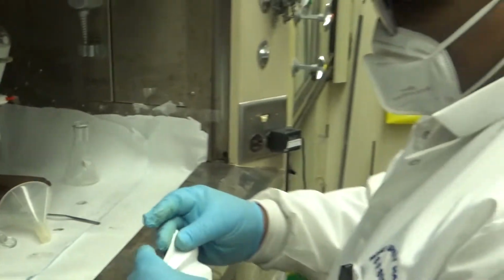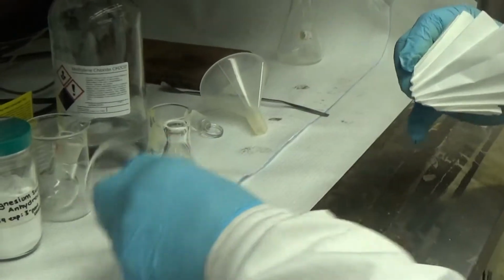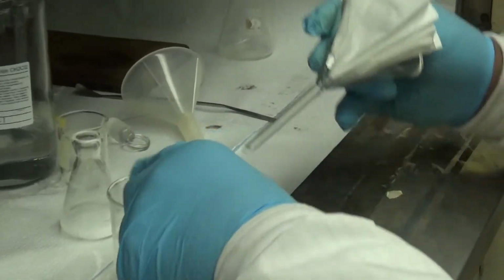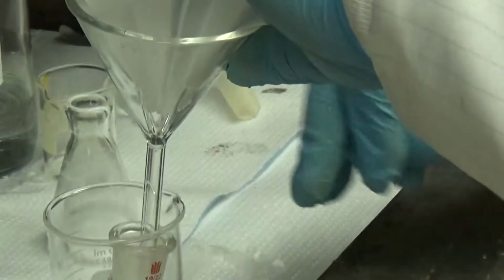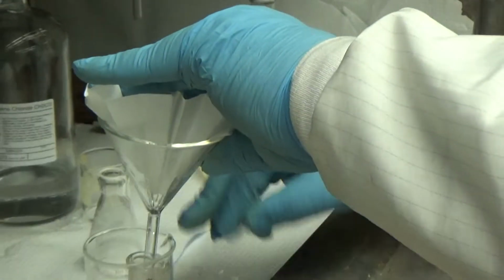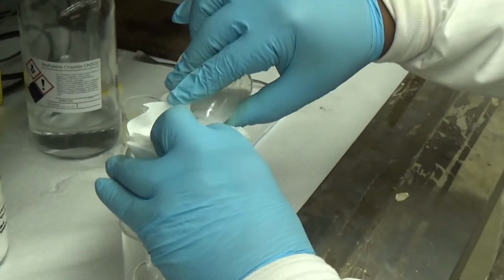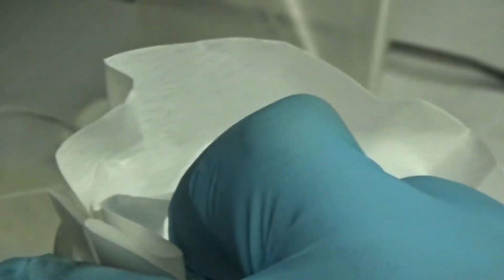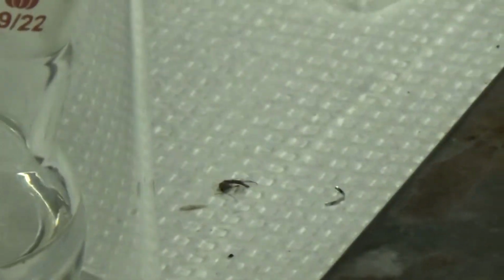The next step will be what is called a gravity filtration. We need a glass funnel and a folded filter paper, filtering into your destination flask, the final one. I put the flask into a beaker to avoid what I call technical mistakes. You just filtered out the magnesium sulfate into the paper. Now the product is there with no salt, no magnesium, and no water. The water should be left with the magnesium in the paper.